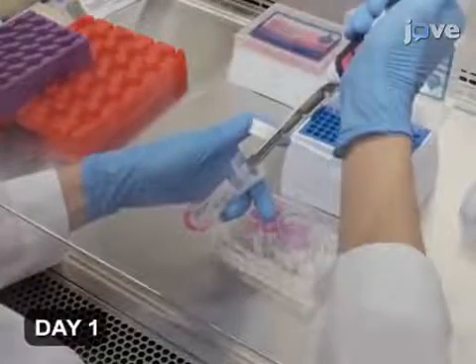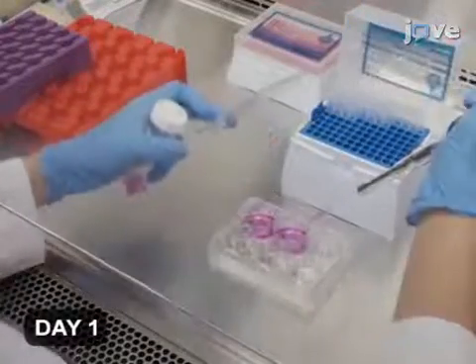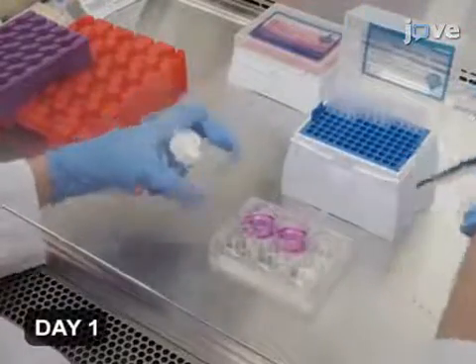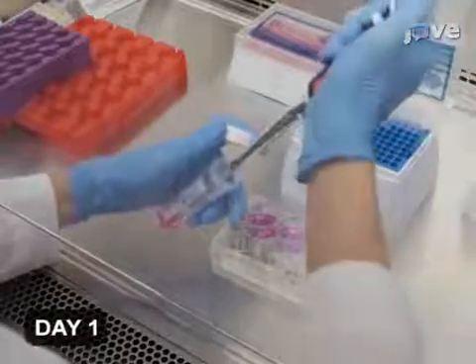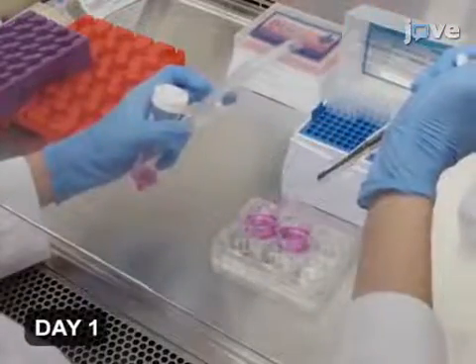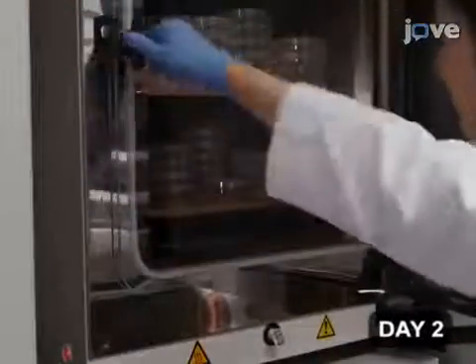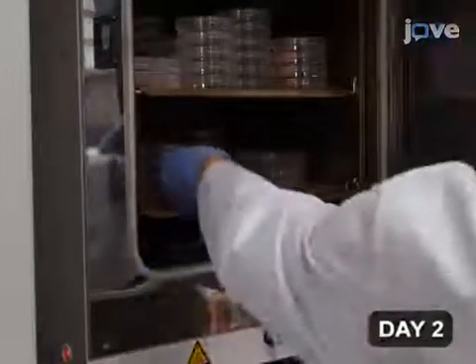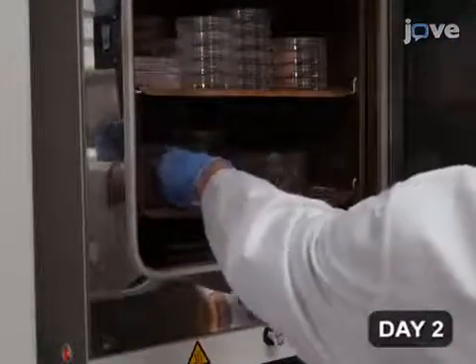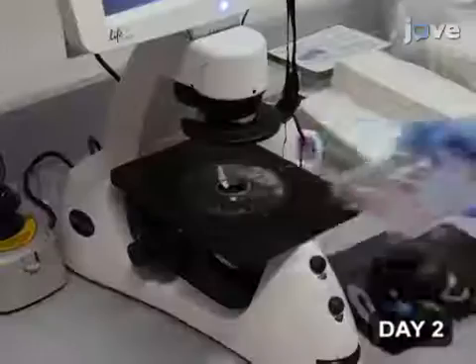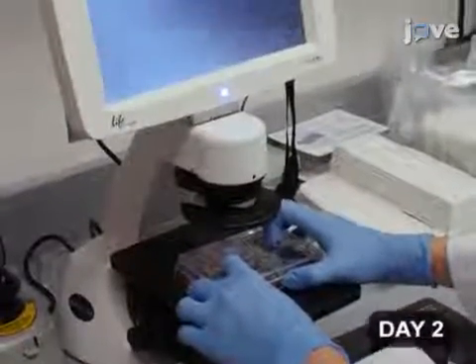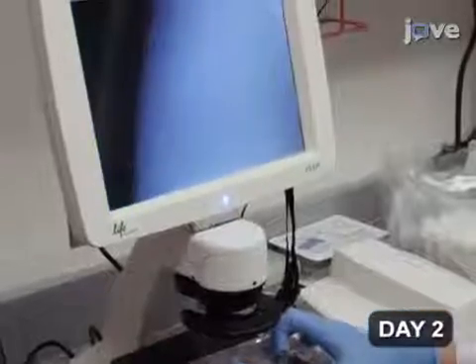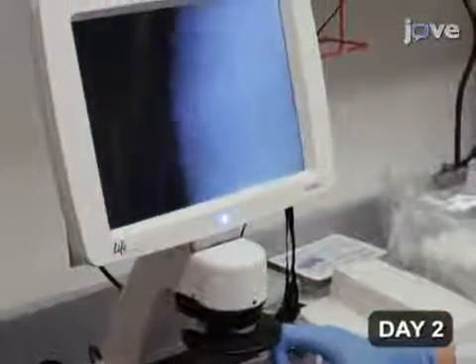On the first day of the transduction, plate three times ten to the fifth HEC-293T cells in each of two wells of a six-well plate in two milliliters of supplemented DMEM. Incubate the plate at 37 degrees Celsius with 5% carbon dioxide. After culturing overnight, examine the cells under a microscope. They should be 40 to 60% confluent.